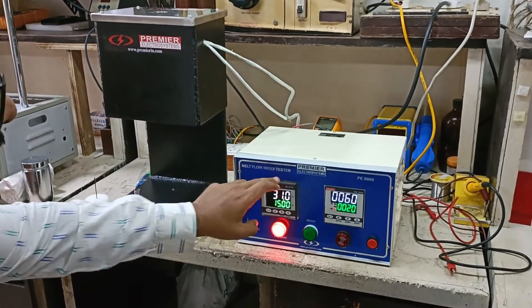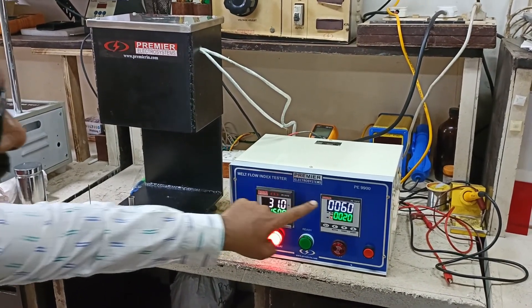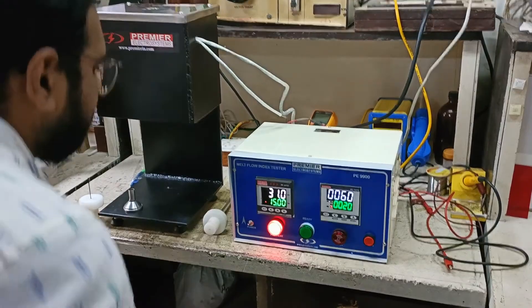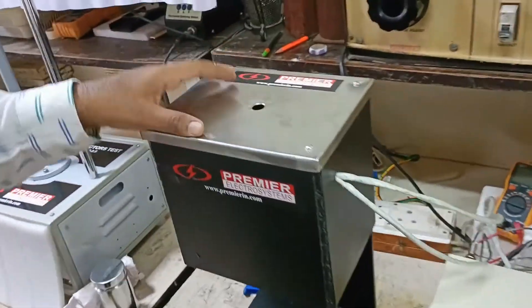Hello, this is Premier's melt flow index tester. This is the control unit comprising of a temperature controller and a timer. This is the mechanical fixture with the dimensions as specified in the standard.